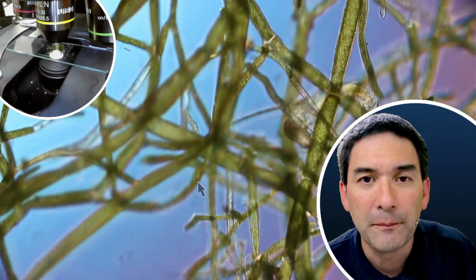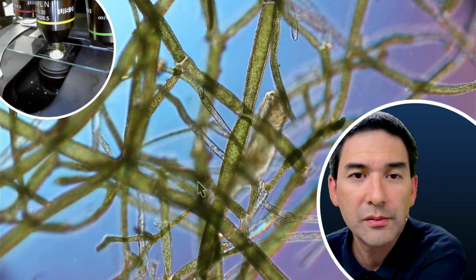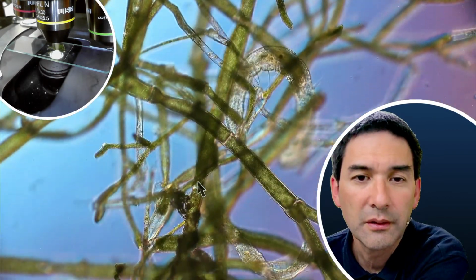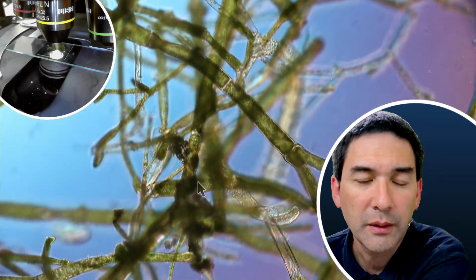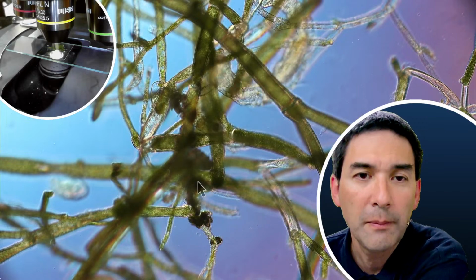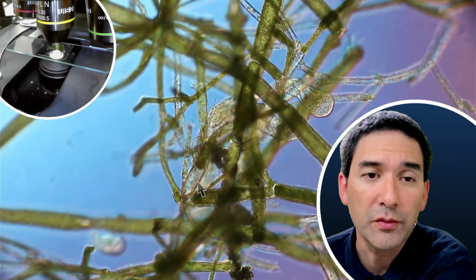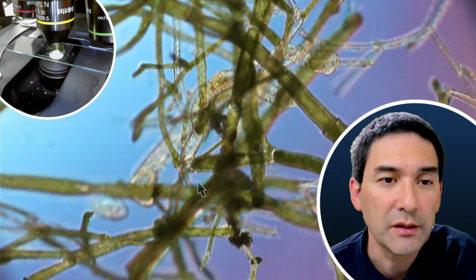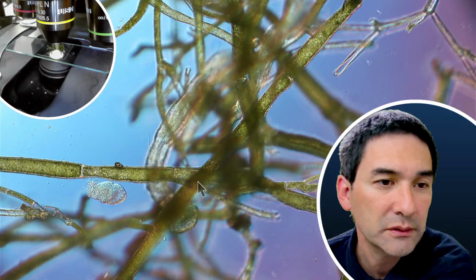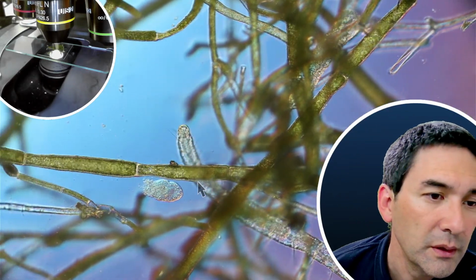And so there are these worms here, quite interesting to observe. They are transparent, so under the stereo microscope they're really difficult to see. They're kind of clear, white in color. What in the world?